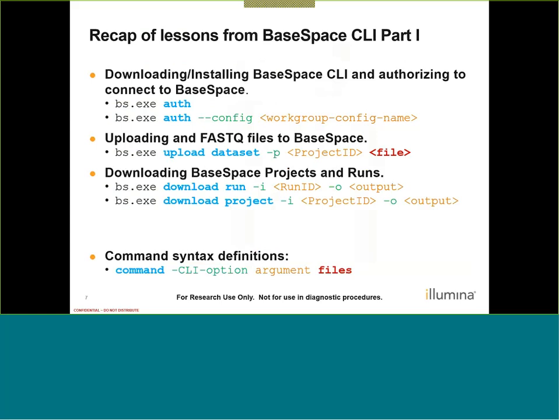So I will say here that the format of the commands I'm showing are specific to the Windows or DOS command line. For the most part, the command structure is identical for the Linux and Mac OS versions, but you'll have just a BS instead of the bs.exe. That .exe is specific to the Windows executable. There is a command later that is an example of this, and I'll call that out when we get to it.